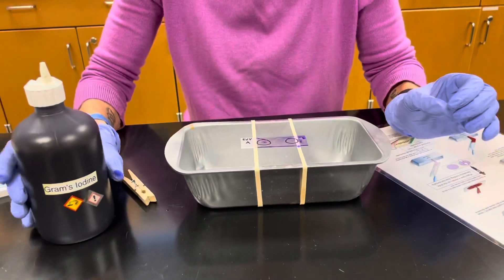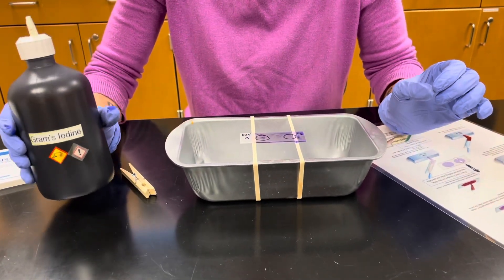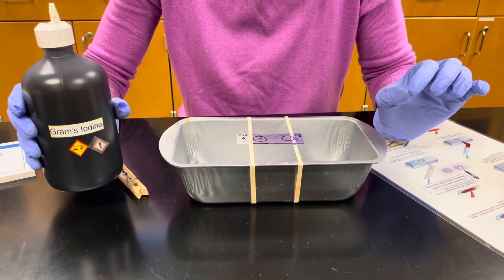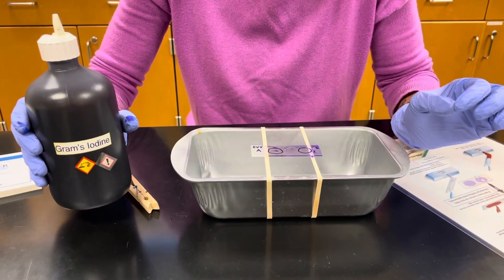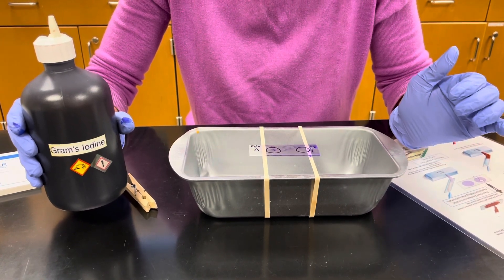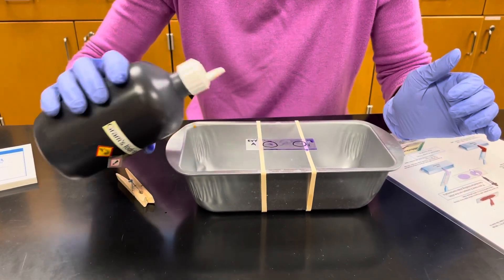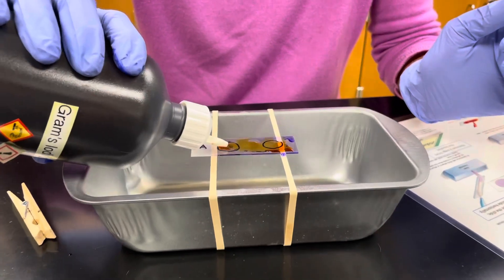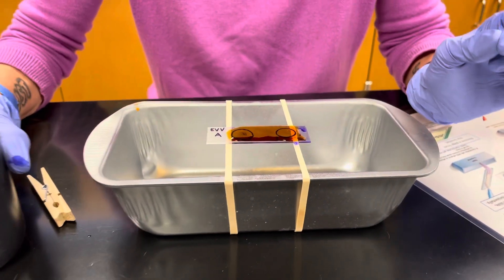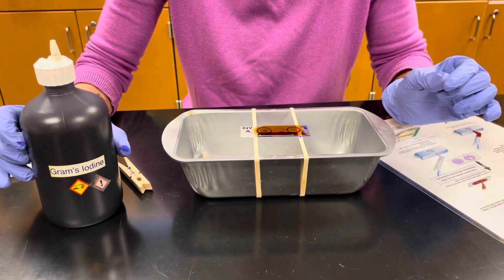The next step is to add a mordant which is going to be Gram's iodine. You're going to cover your smear. What the iodine is going to do, it's going to form a crystal violet iodine complex that's going to get trapped inside of the Gram positive cells. You allow the mordant to sit on your smear for one minute.